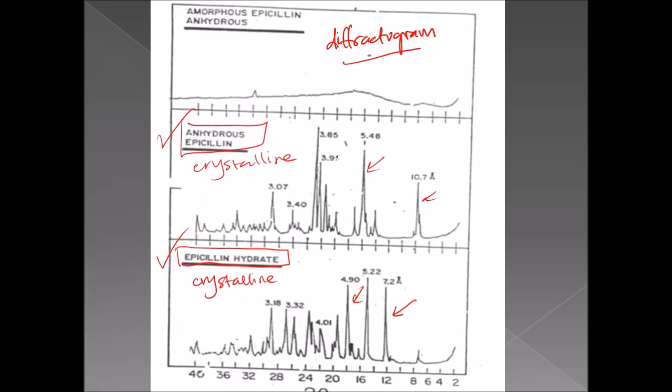And how do you differentiate the crystal from amorphous? As I said, in amorphous you won't have any sharp peak, but you have something like this, which you call a halo pattern. Perhaps there are some peaks here which you might expect. Maybe there is some contamination of crystal structure in this particular sample over time.